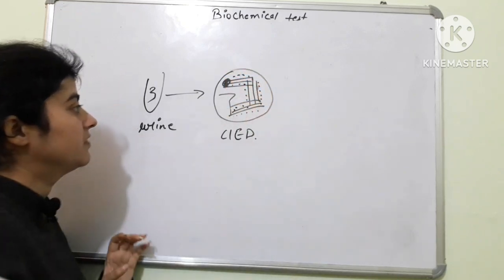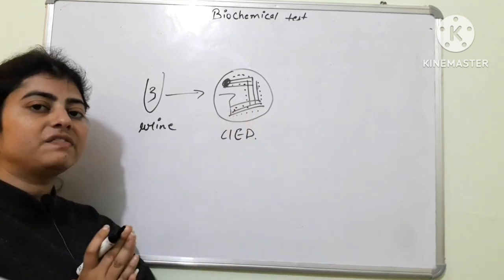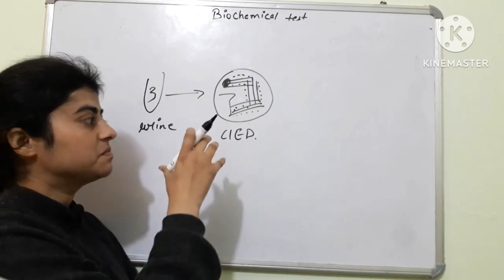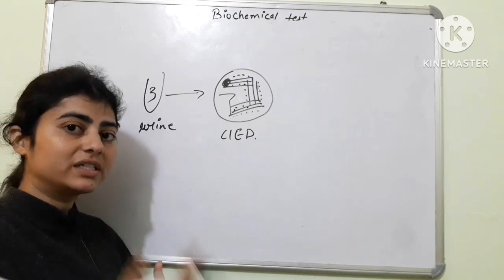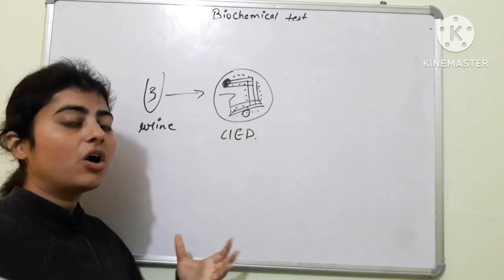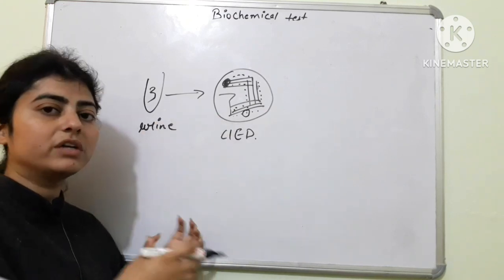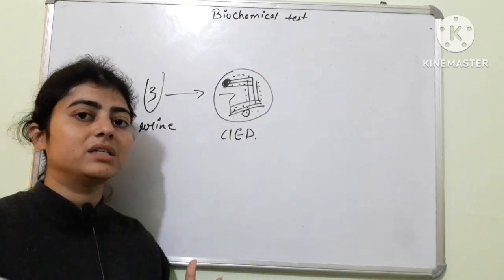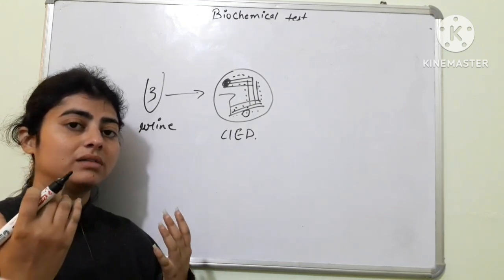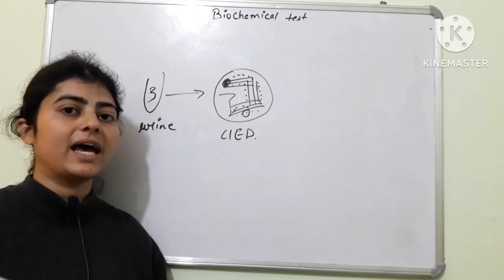Right. Now we will look at this Petri plate and identify proper colonies that we have to further analyze. For example, I selected this colony. Now on what basis will you select a colony? You cannot select any random colony from this Petri plate. There are some parameters that help you to identify and pick up the appropriate colony for further diagnosis.